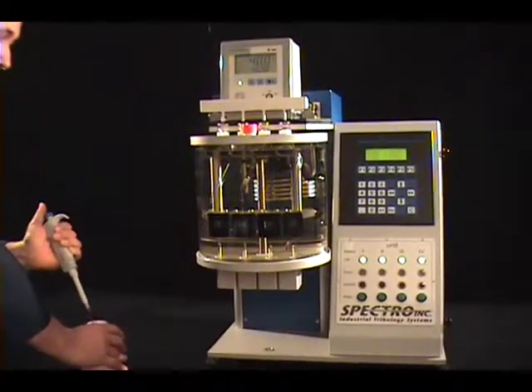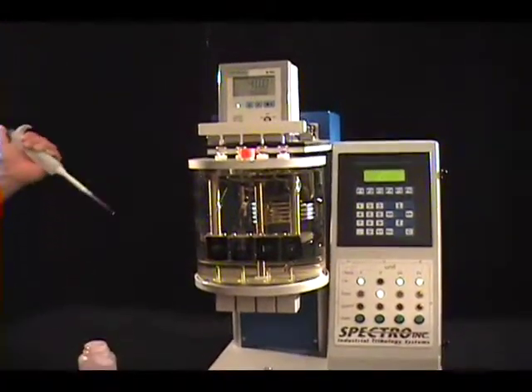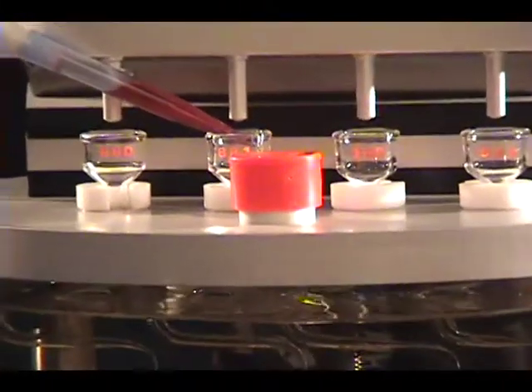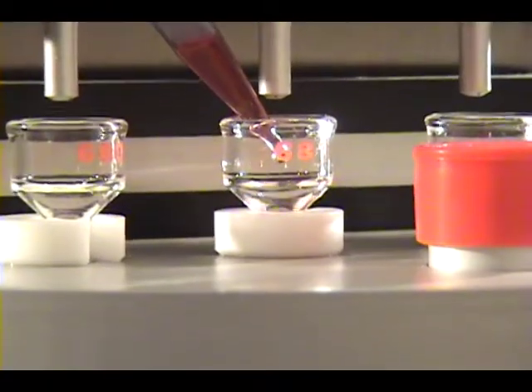All measuring tubes function independently of each other, which allows for a high sample throughput of up to 60 samples per hour to ASTM precision. The SpectroVisc uses a very small sample volume between 0.3 and 0.6 milliliters.